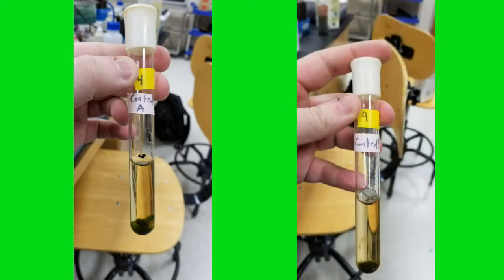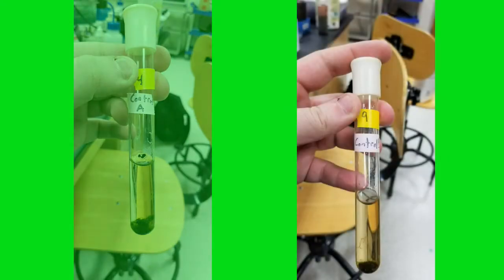The pH cannot be too low because the hydrogen ions will compete for absorption, but it also cannot be higher because the alkalinity obscures the absorption of the ions. Our hypothesis that changing the pH of the algal samples would kill it was not supported because the control samples had decaying algae. The algae samples may have died due to the timing of nutrients or an unknown external factor capable of influencing pH.